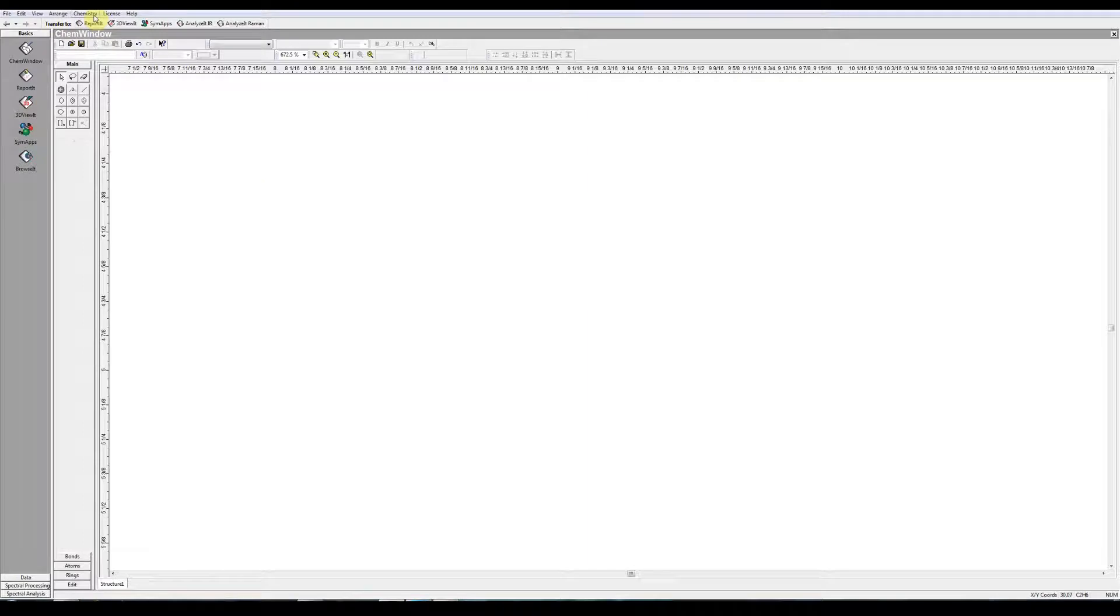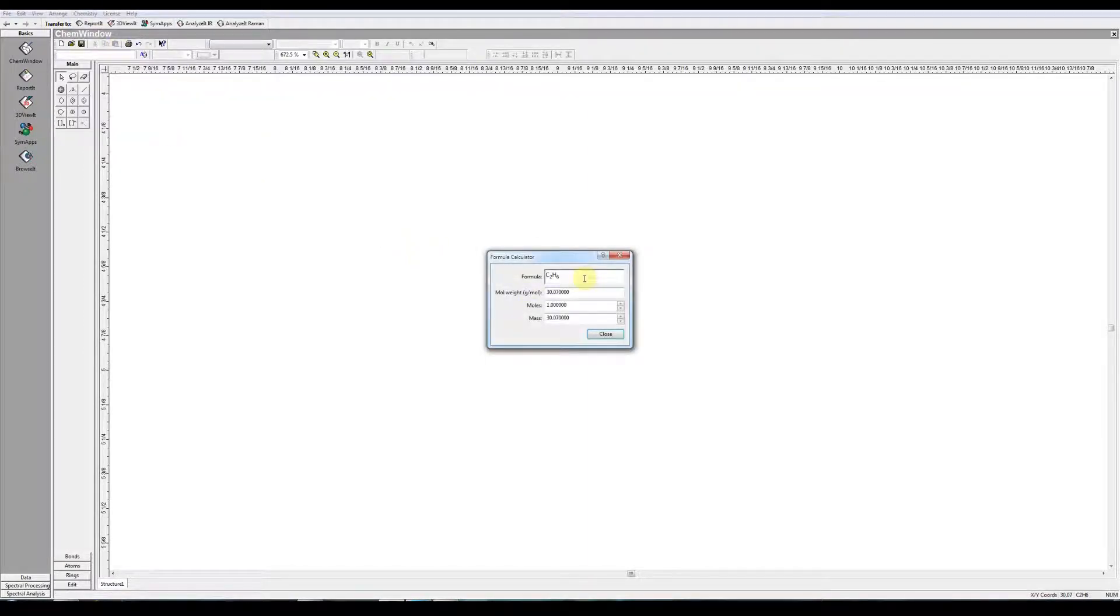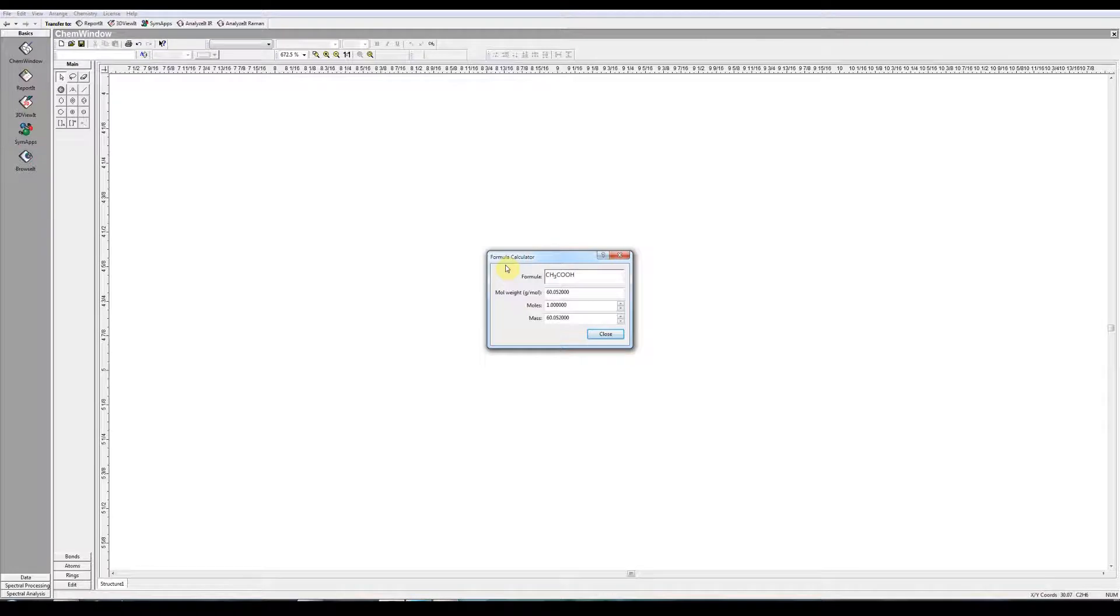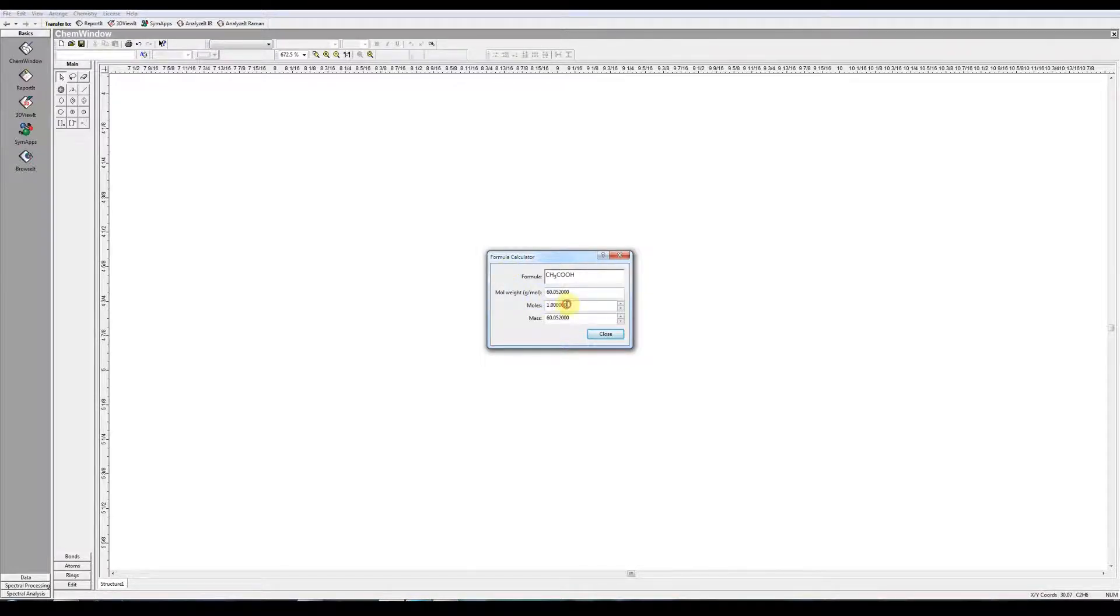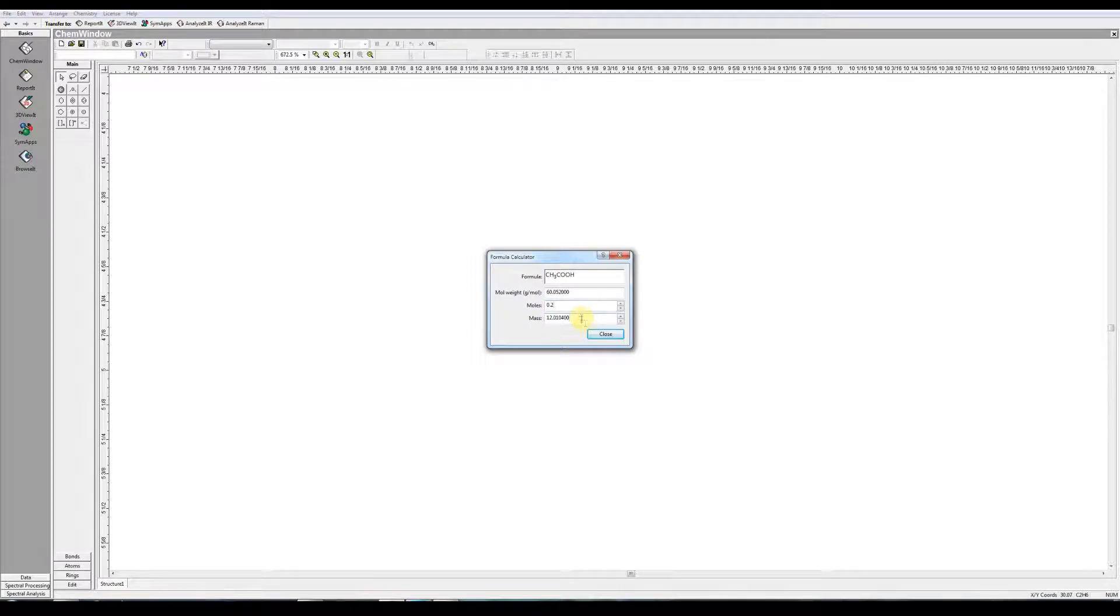Couple more things here. Check out Chemistry Formula Calculator. You can type in the formula of any compound you wish. CH3COOH, acetic acid, and it tells you the molar mass. If you want to know the mass of, say, a lesser quantity or a different quantity, 0.2 moles, and it calculates that for you.